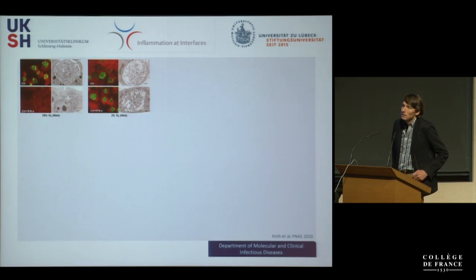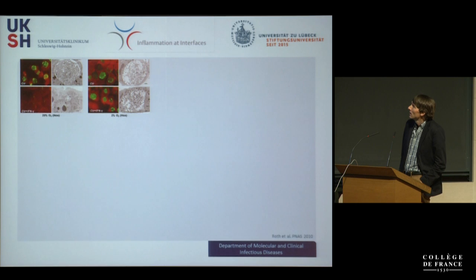So the experimental setup which we had is very simple. We just grow the pathogens in a normal cell culture, also in HeLa cells, and what you normally observe are these large inclusions. So this is an electron microscopy image where you see a lot of these already redifferentiated small dots. These are the infectious elementary bodies.